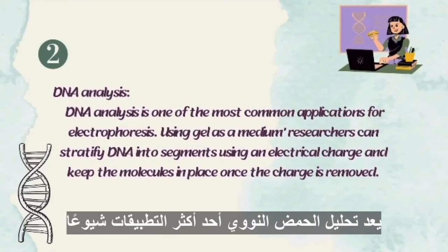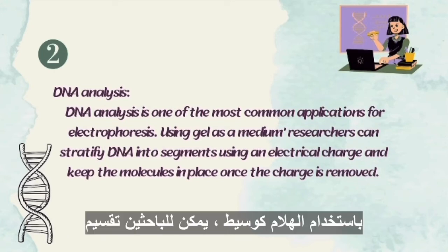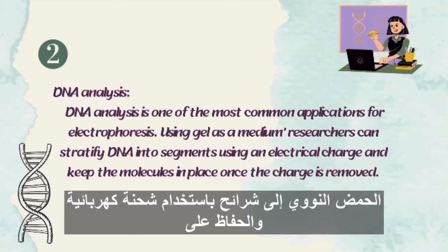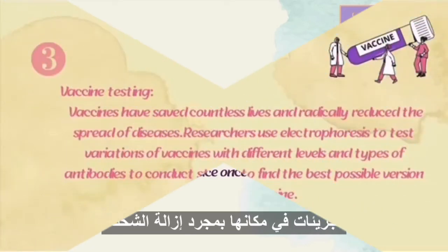DNA analysis. DNA analysis is one of the most common applications for electrophoresis. Using gel as a medium, researchers can separate DNA into segments using an electrical charge and keep the molecules in place once the charge is removed.